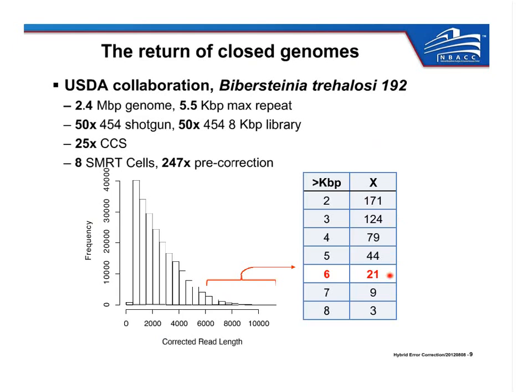I mentioned nanopore sequencing in the introduction. Do you anticipate that a year from now, if and when these are in full commercial release, you could, in principle, substitute long nanopore reads for PacBio? Yes, our approach doesn't care what the input is, and the approach is general enough that it will work just fine for any type of high error long read. So if Oxford Nanopore is able to produce reads that, say, have 10% error, and they're of equivalent length to these PacBio reads, our approach will work just as well as it's working on these, probably better.